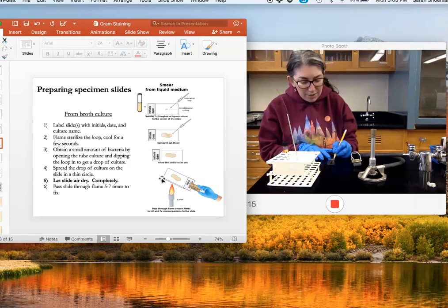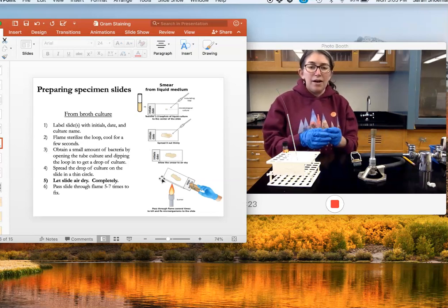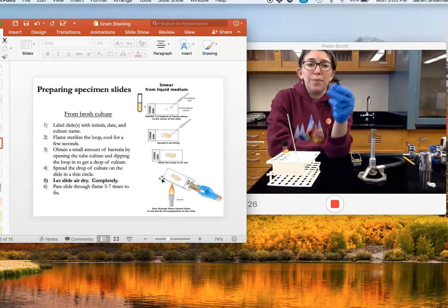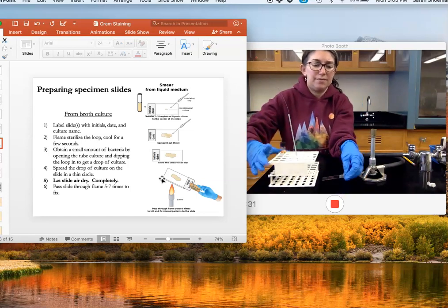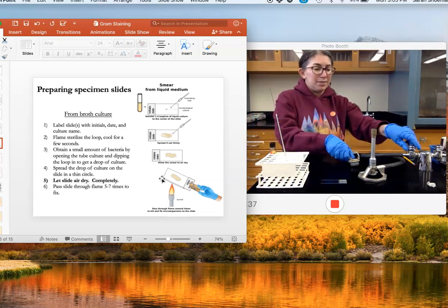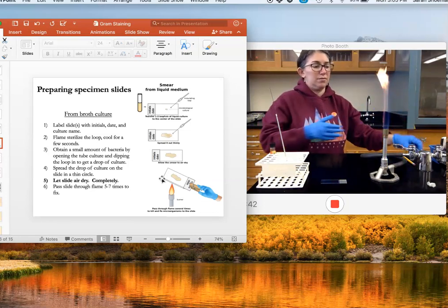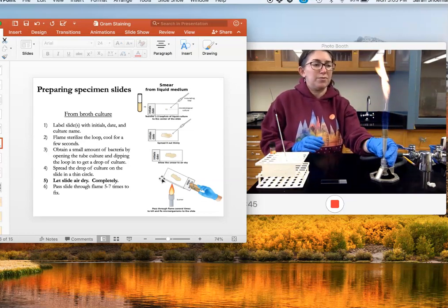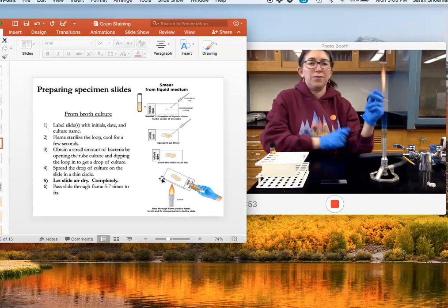You'll want to label with your initials and the date, and it's not a bad idea to also note what this is — so I'm going to write 'gram' on here so I know what this slide is. Now we're going to put the bacteria on the slide. I'm going to get my Bunsen burner on and flame my inoculating loop — hold it in the middle of the blue area, it turns orange when the loop is in there. I'll get it all nice and hot and sterilize it all the way down, then let it cool.